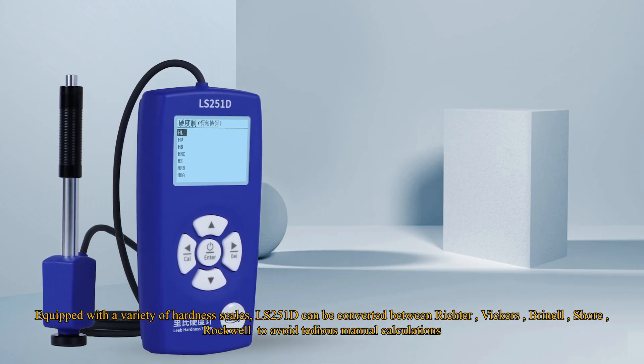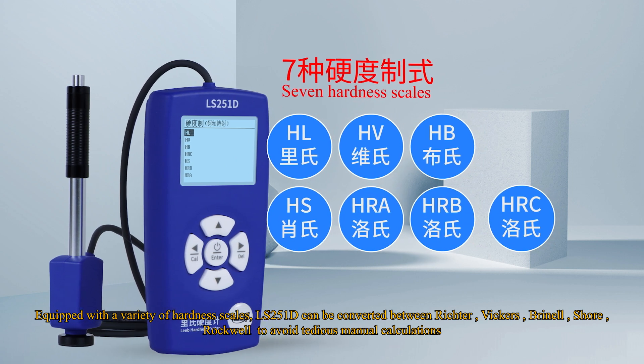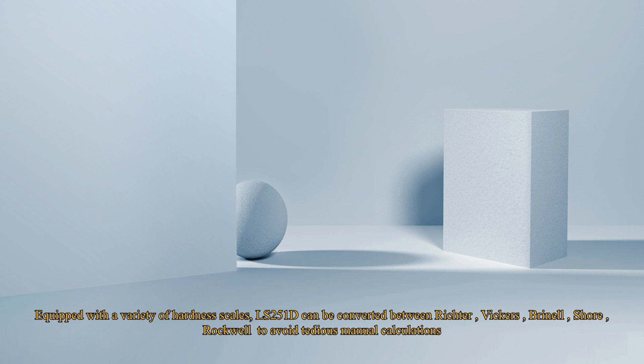Equipped with a variety of hardness scales, the LS251D can be converted between Leeb, Vickers, Brinell, Shore, and Rockwell to avoid tedious manual calculations.